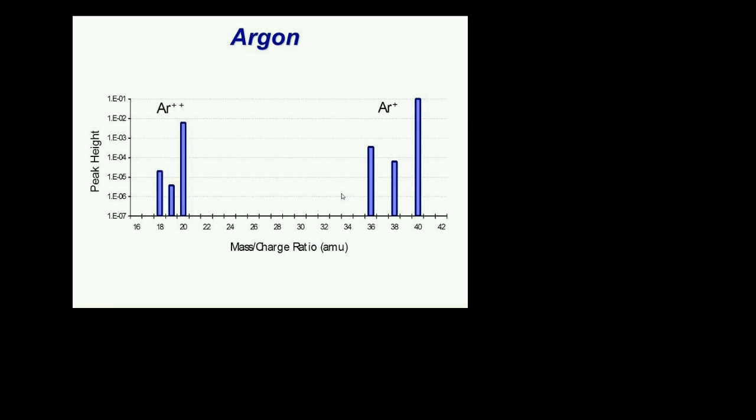But I honestly believe that for you to start using an RGA and be successful with it, the trick is to know your background gases in your RGA. They will be different for every RGA. They will change over time. They will depend on the history of the RGA. Somebody borrowed it, comes back to you, it will change. But know what that is.